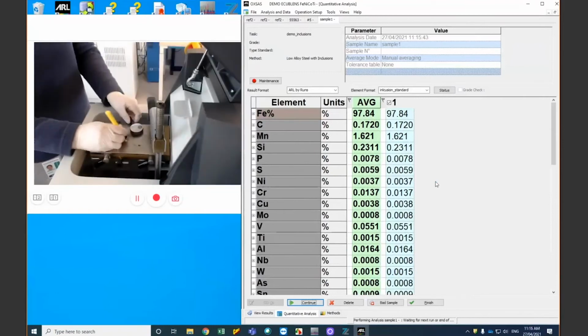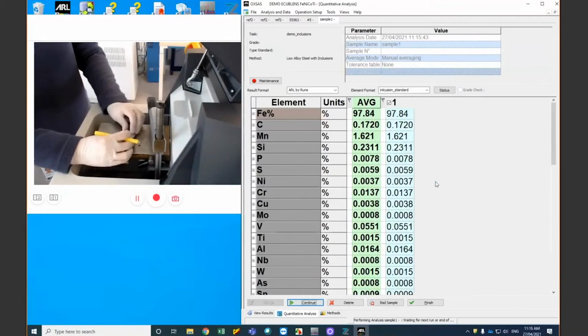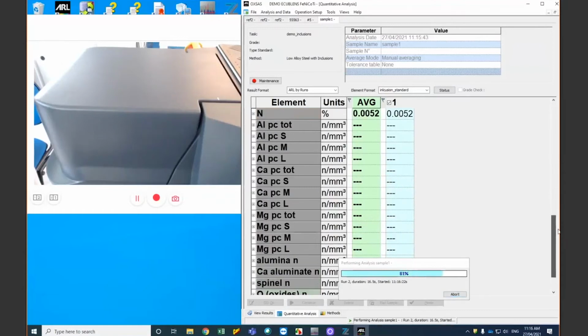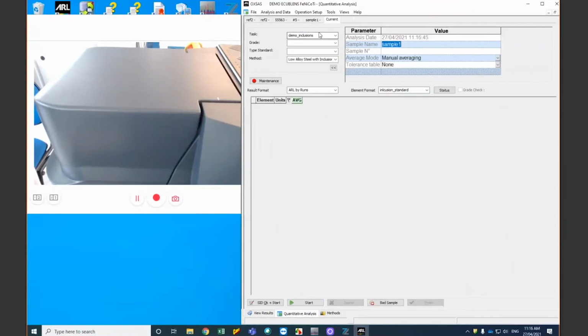As a normal analysis, I make 2 runs. During the analysis, we have the list of the results for inclusion, but for the moment, there are no results yet because of the way we treat the data; you will get it after the analysis when you finish.